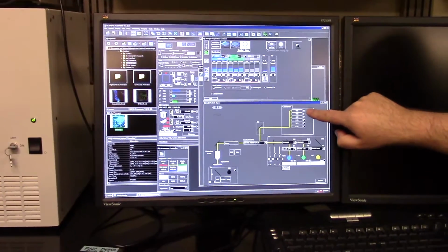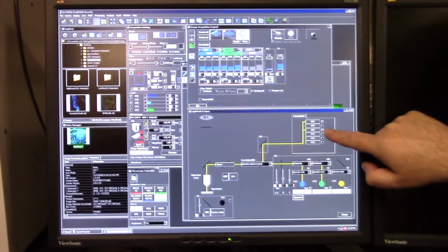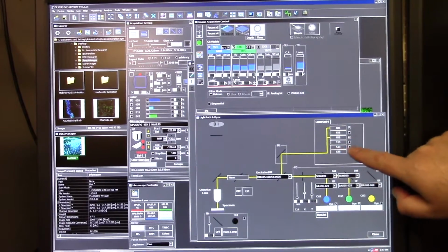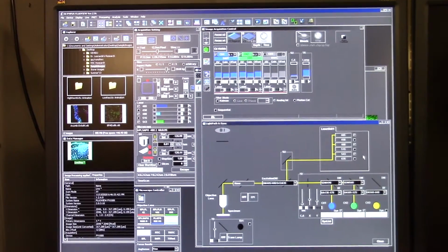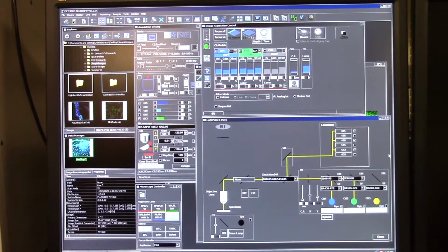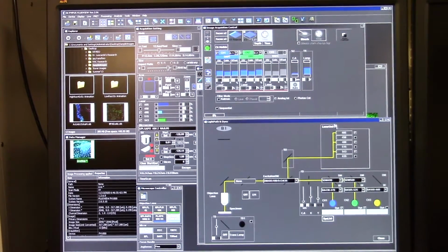So here are our lasers on this computer screen. 405 is turned on. That's a deep blue, a purple. 488 is turned on. That's a blue light that will excite our green 488. Oh look, 543 isn't turned on. 543 is a good color to excite our red dye. So it's a greenish yellow, 543. So now we have 3 lasers coming out of the big laser scan unit.